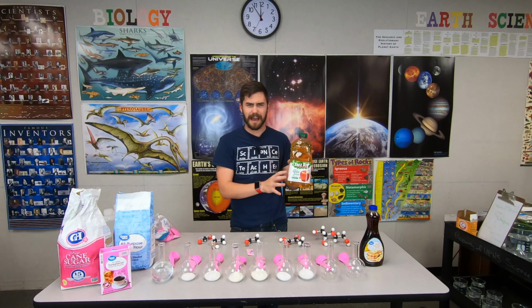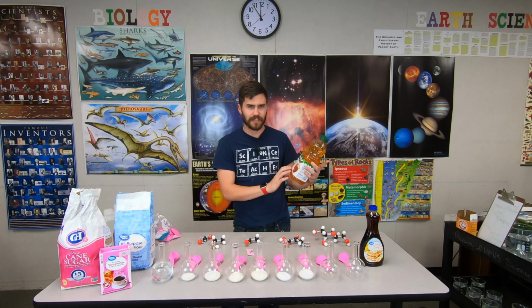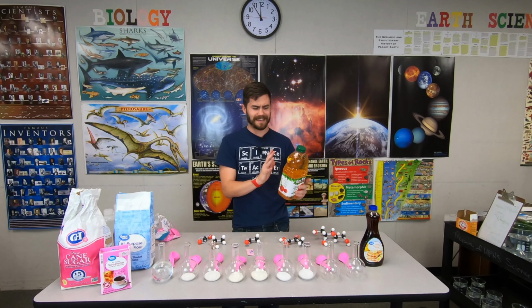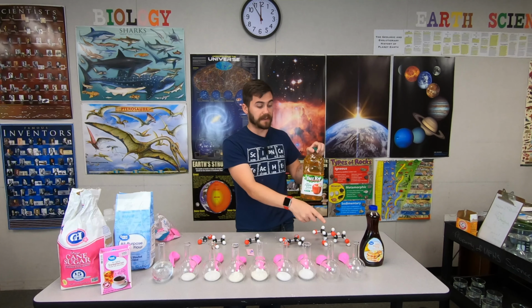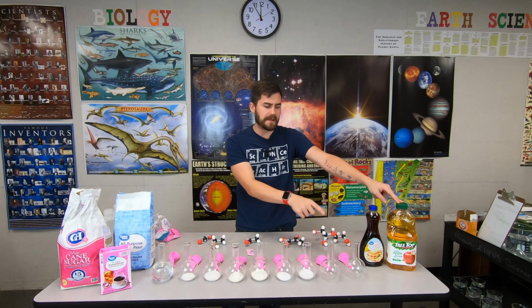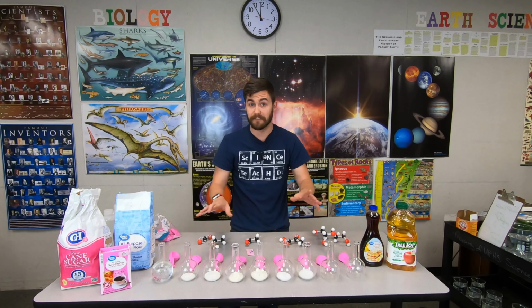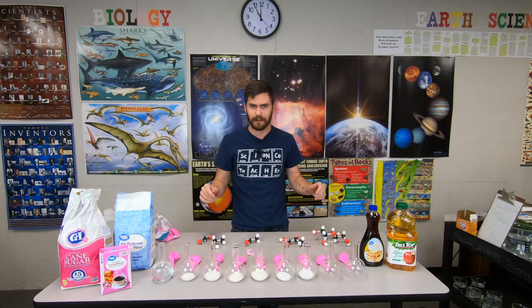Now, I believe apple juice, the sugar in it is sucrose, but it may be a combination of sucrose and glucose. I'm not 100% sure. The label doesn't tell me. I Googled it and I didn't find any definitive answer either. There will be 200 milliliters of apple juice in that flask, and I checked the label and there will be about 23 grams of carbohydrate in that beaker, so very similar to these 3 flasks. With the magic of video editing, I will really quickly set all of this up.